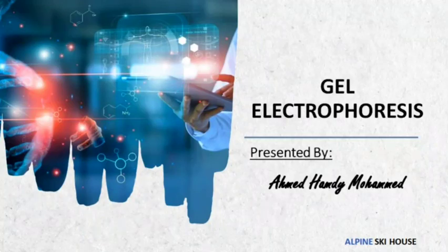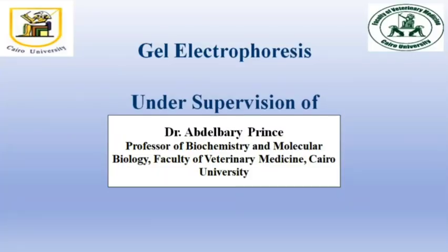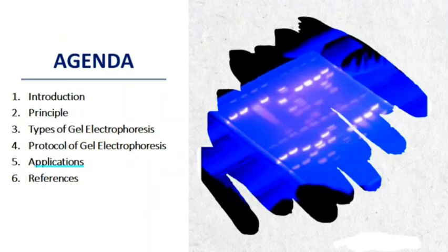In this presentation we will talk about gel electrophoresis. We will cover these topics: introduction, principal types of gel electrophoresis, protocol of gel electrophoresis, and application.